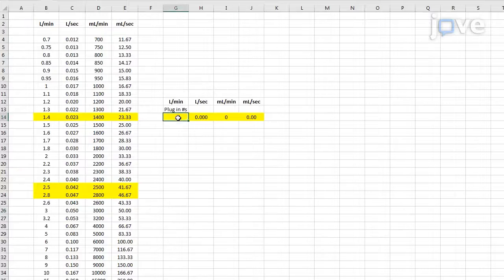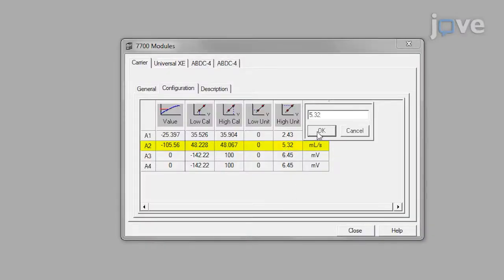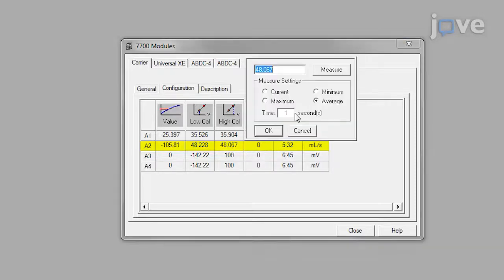Next, convert the inflow value measured from the flow meter from liters per minute into milliliters per second and click the high unit cell to enter the value in milliliters per second. Double-click High Cal, change the time to 3 seconds and click Measure.